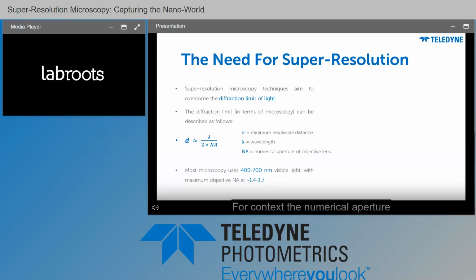For context, the numerical aperture basically describes how much light in terms of an angle the lens can aim at the subject. So the better the numerical aperture, the better the overall maximum spatial resolution of your imaging system.